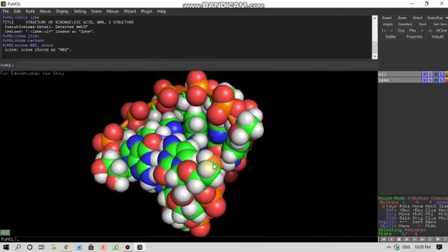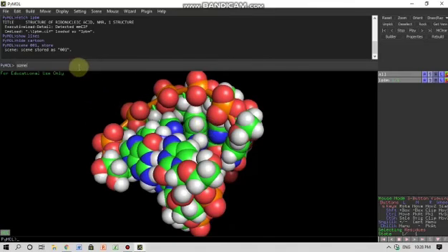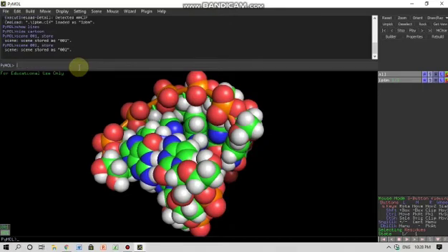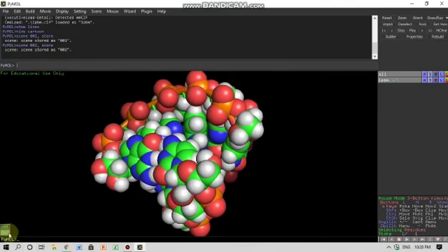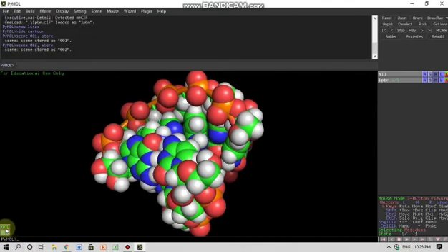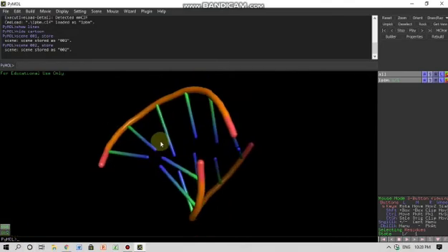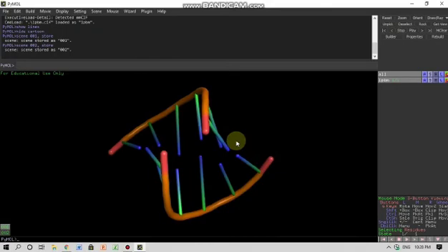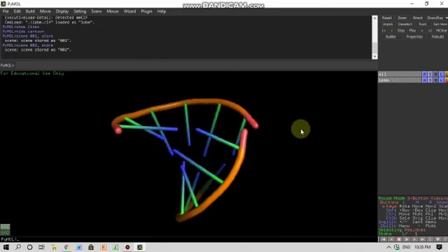But I also want to store this as well. I can write here as scene 002 comma store and then enter. So this scene will be saved here. This is scene two and this is scene one. So one of the biggest advantages of this software is that you can revert back anytime you want, but before that you have to save the scenes.